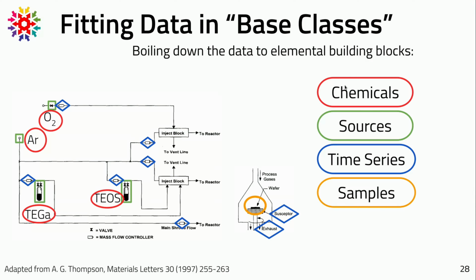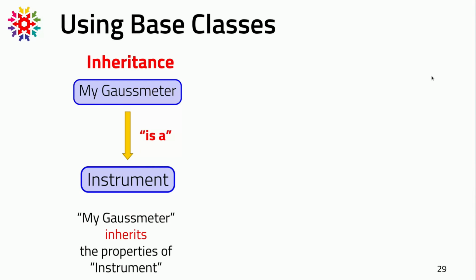These classes are meant to be general enough to be used also outside the specific experiment. So they are generated from one, but then hopefully they would acquire more generality to be shared among different experiments. And indeed, what we do with these classes is essentially an object-oriented approach. There are two main concepts connected to object-oriented programming.